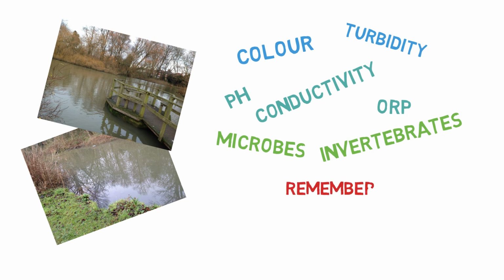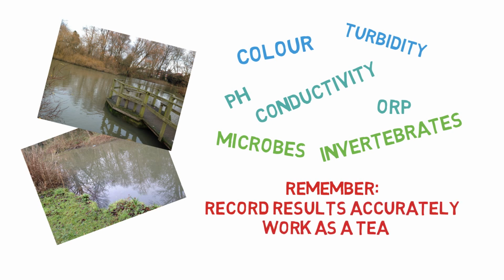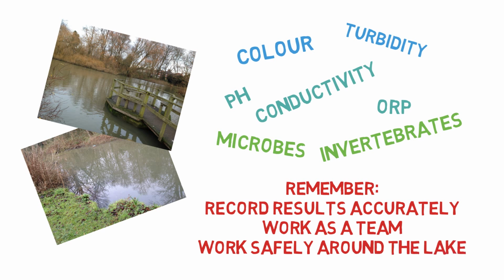Remember, while you're working, you'll need to take detailed notes of everything you're doing. You'll need to divide up the tasks between you and your group to get everything done within the time, and do be careful about your safety when you're working near the lake. We'll be giving you life jackets and waders, but please do think about your safety as you're working.